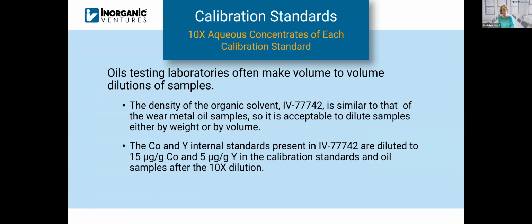So speaking of the volume-to-volume dilutions, the density of our solvent, 77742, is very similar to that of the oil samples. So with the densities being equivalent, it's acceptable to dilute the oil samples weight to weight or volume to volume into the solvent.